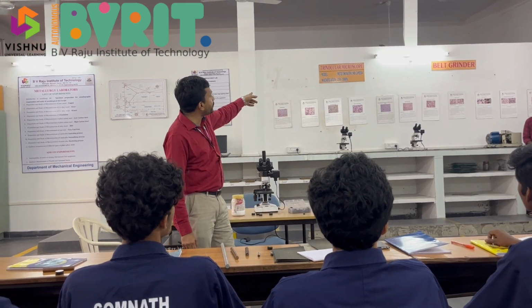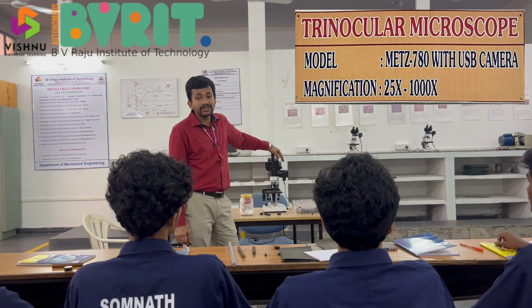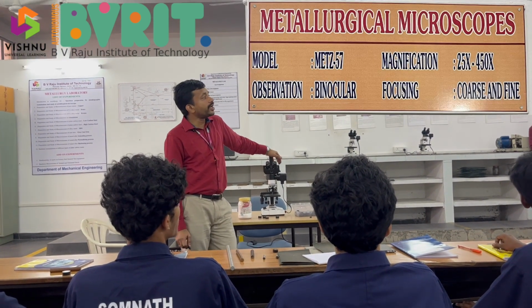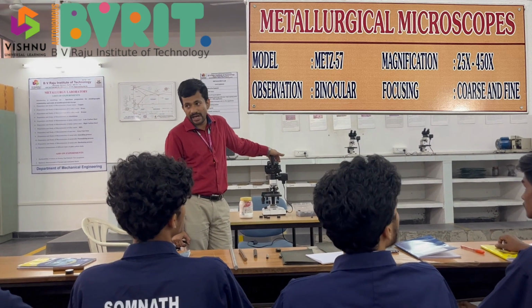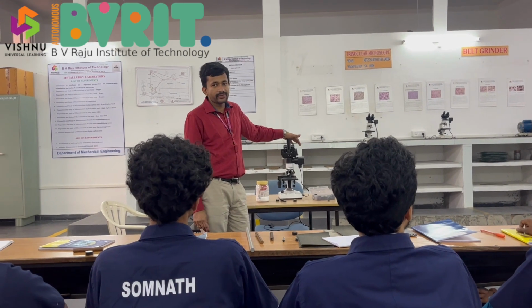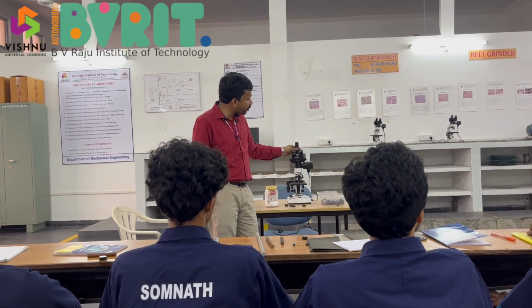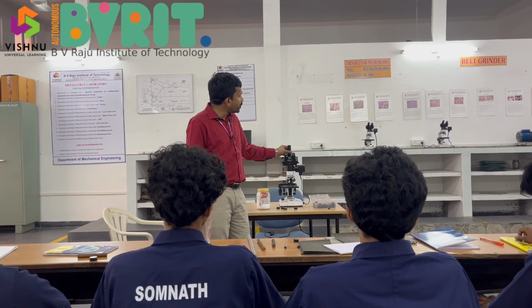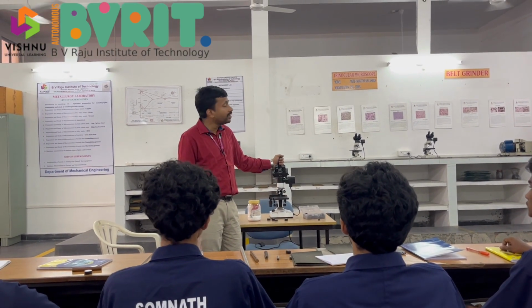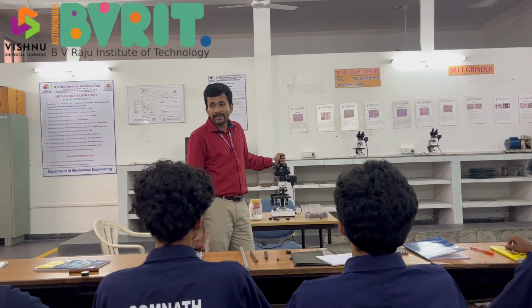The trinocular microscope has 25x to 1000x magnification, whereas the binocular has 25x to 450x only. So the objective length is a little different there. That is one thing, and of course the trinocular has this portion which helps us fit the camera attachment. So that is about the trinocular and binocular microscopes.